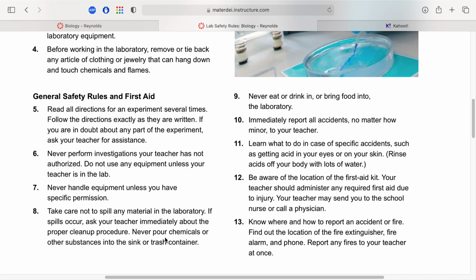Oh, how about the gas spigots at your table? They're turned off at the source, so if you were to turn it so that the handle is perpendicular with the pipe, it's, so to speak, on, but there's no gas coming out. Turned off at the source. Whenever you turn a gas line or a water line, it's called a gate valve. When it's like that, it's turned off.